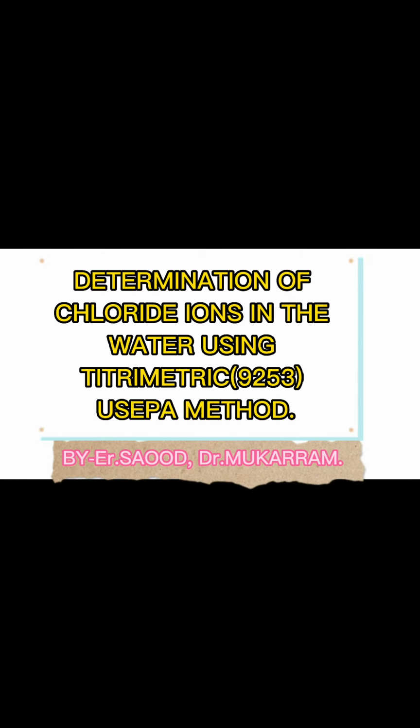Determination of chloride ions in the water using the titrimetric argentometric method.